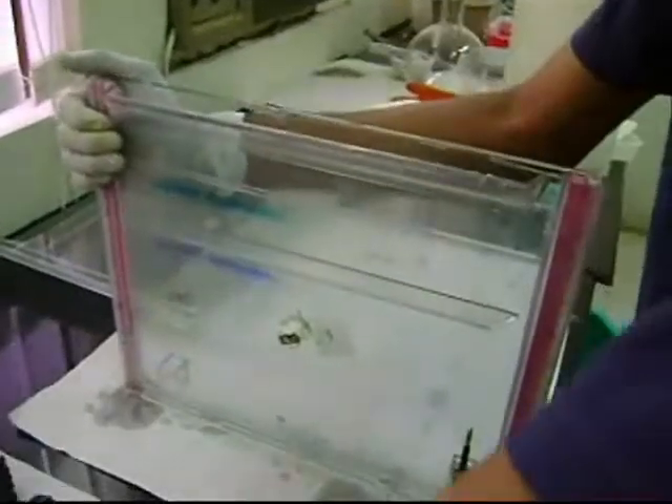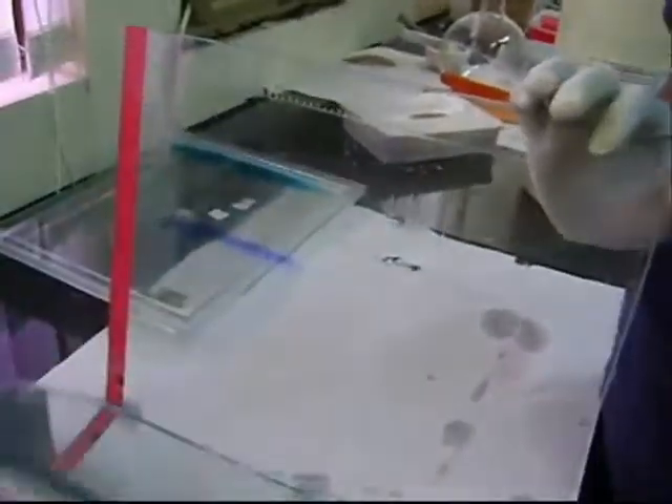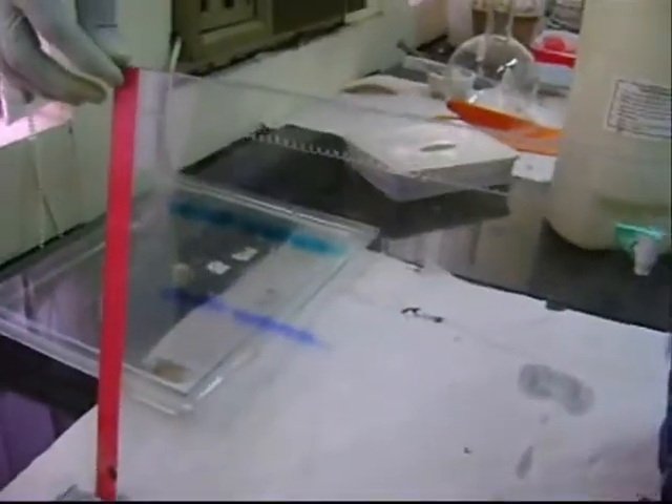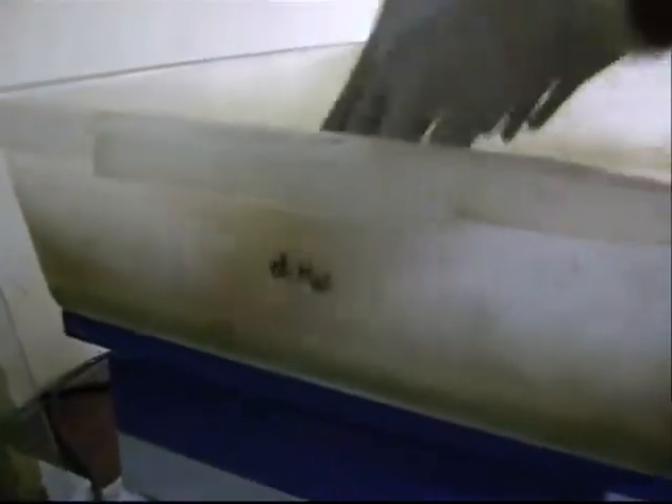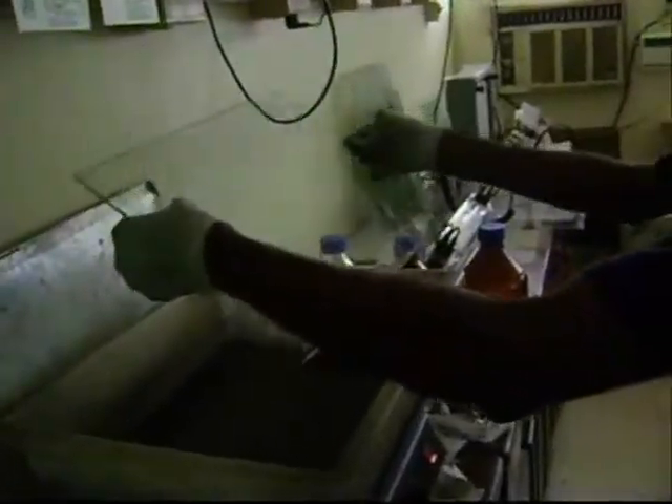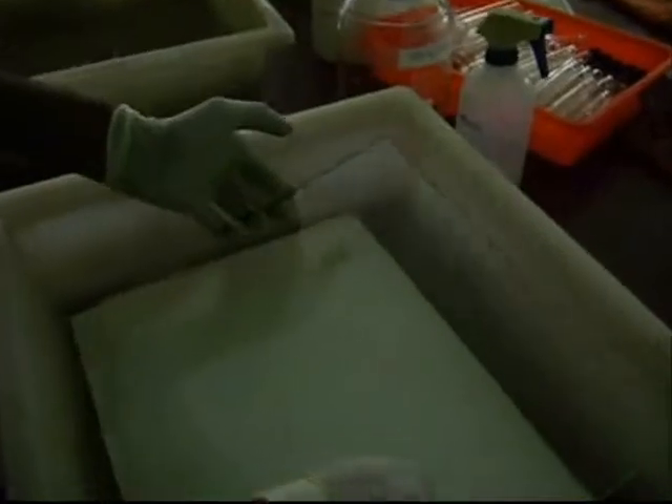The buffer is drained and the glass plate and IPC chamber are separated. The plate is kept in fixer and washed with double-distilled water. The plate is then treated with developer until bands appear. It is air-dried and documented. Several plates are analyzed with various types of markers and the marker data is generated.